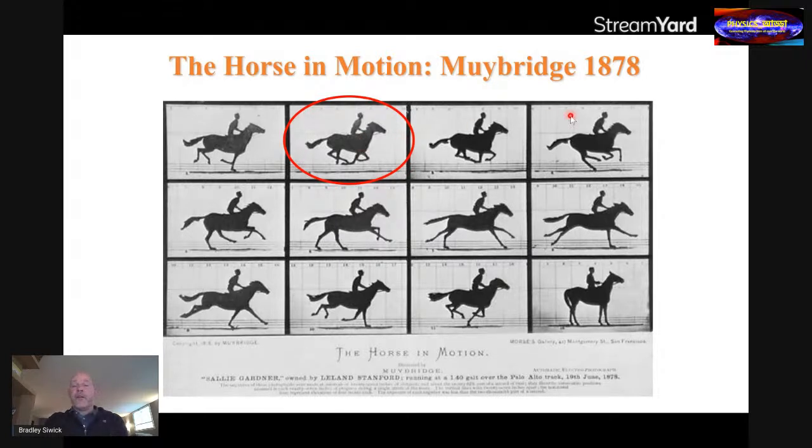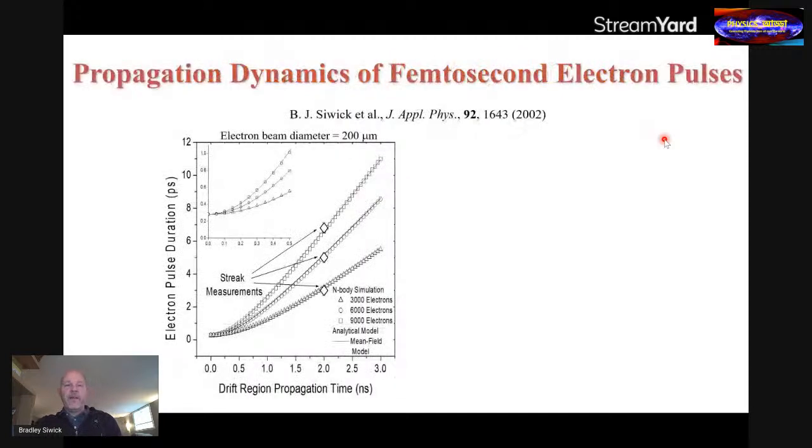So the primary difference between what you're seeing on your slide here and the kinds of experiments we can do is both the nature of the spatial resolution and time resolution that's obtainable. Okay, so one of the most difficult things to do is to actually get the required ultra-short electron pulses at the sample. And the difficulty there is what I mentioned a couple of slides ago.